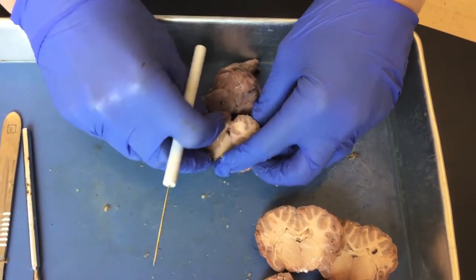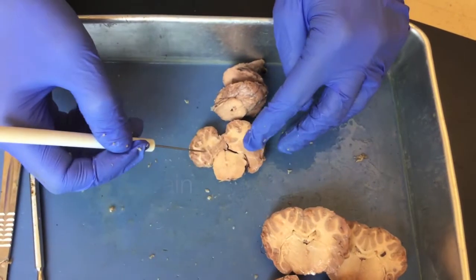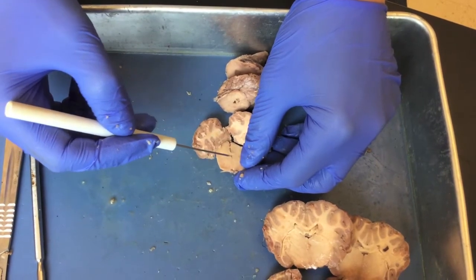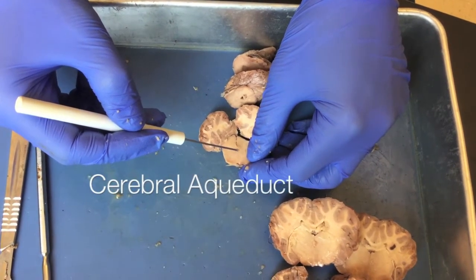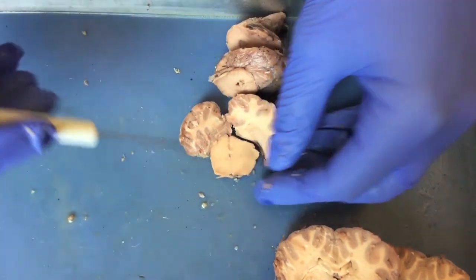Moving further posteriorly, we're now at the midbrain. Remember that the midbrain is the location of the superior colliculus and the inferior colliculus. And you can see here we have the cerebral aqueduct. Remember that it's a very narrow avenue for connecting the third ventricle to the fourth ventricle.